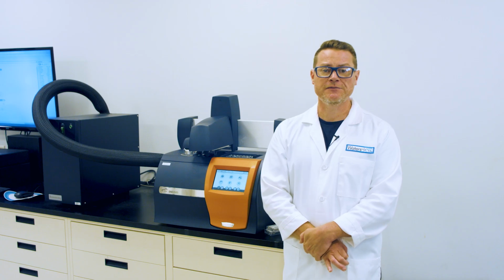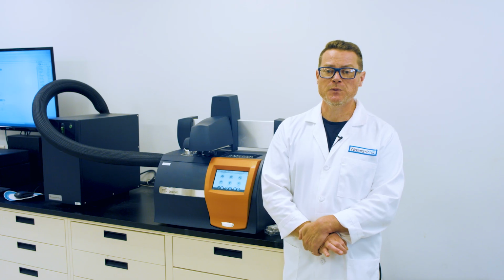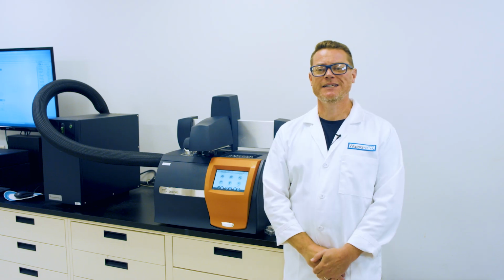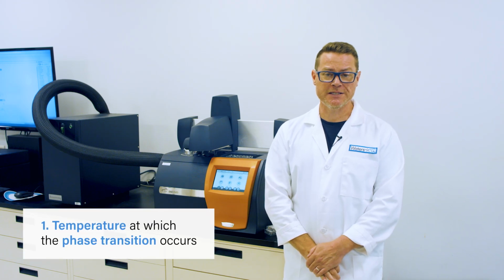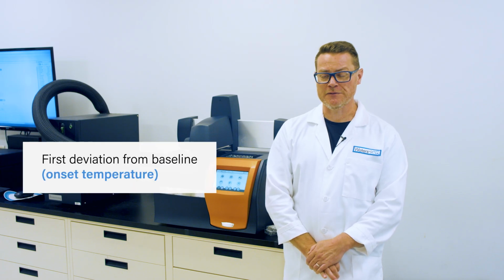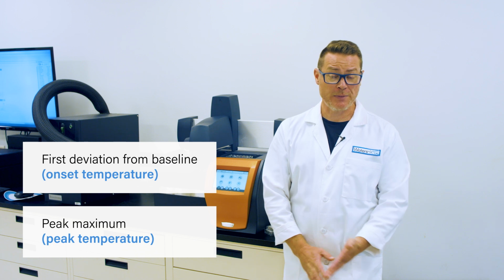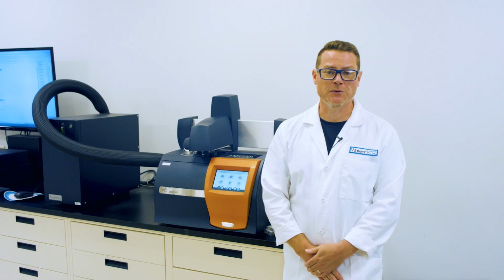Because the equations of heat flow are well understood, it is possible to calculate the difference in power between the sample and reference materials, and this leads to a peak in the DSC data, rather like this. What information can we get from these data? The first thing we can determine is the temperature at which the phase transition occurs. We can define this either as the first deviation from baseline, called the onset temperature, or as the peak maximum, the peak temperature. It doesn't matter which you use, so long as you define which you are using.